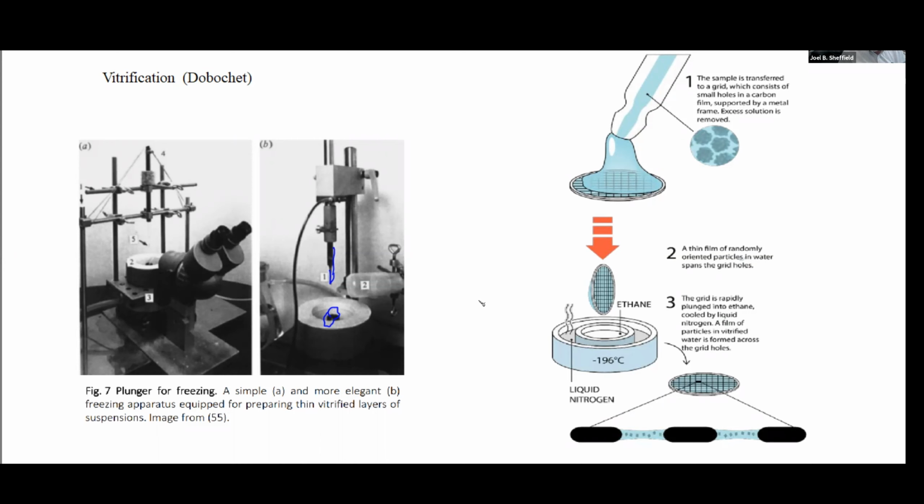That is, it's sitting in a temperature path or in a phase diagram. Here's sort of a phase diagram. You can imagine liquid nitrogen here, and gas here.